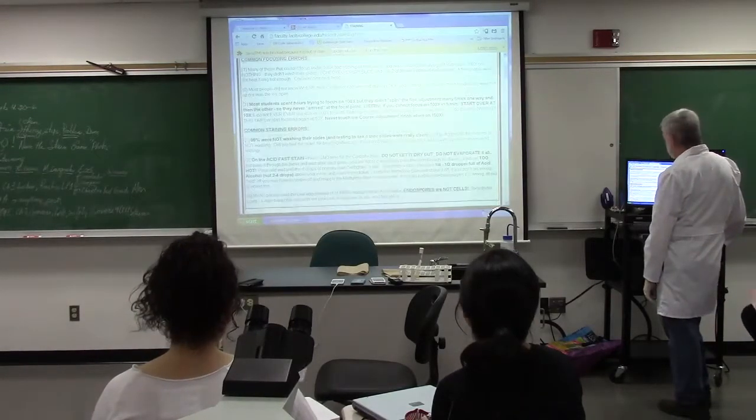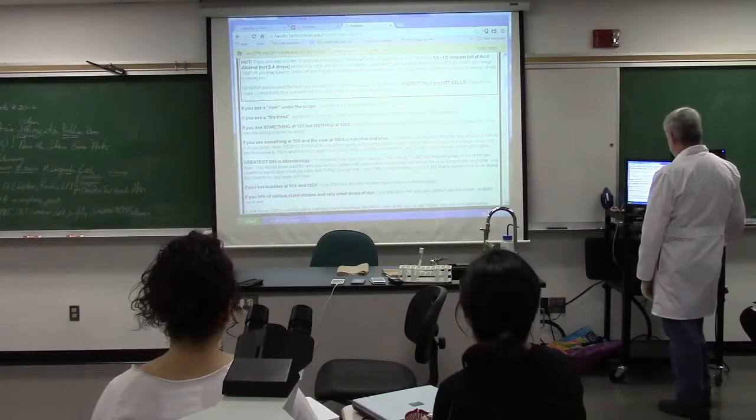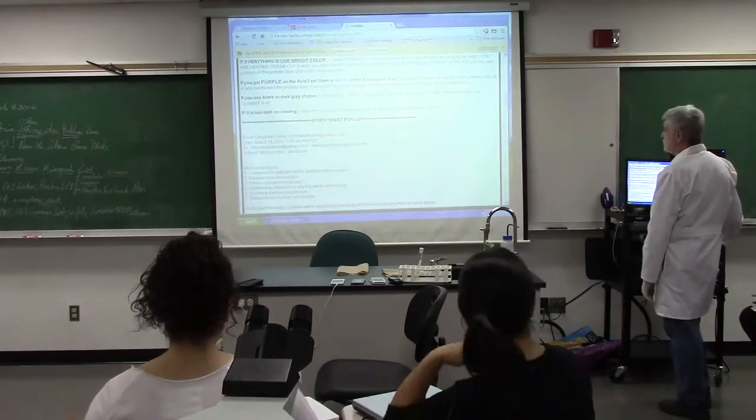Comments and common focusing errors and questions, and if you see something, if you see a river, what is it? If you see tire tread appearance, what does that mean? All of these things will be on the test.